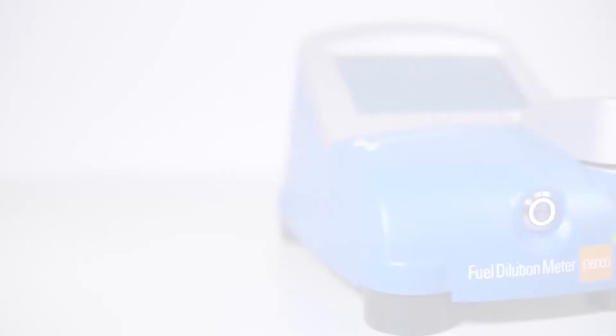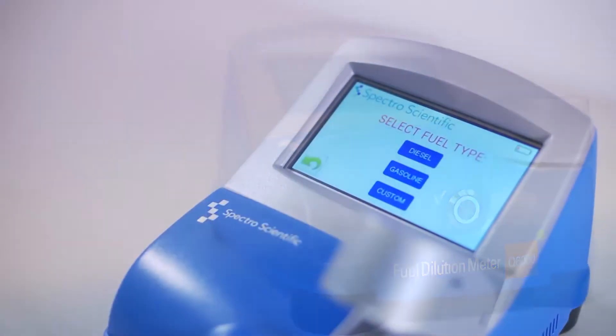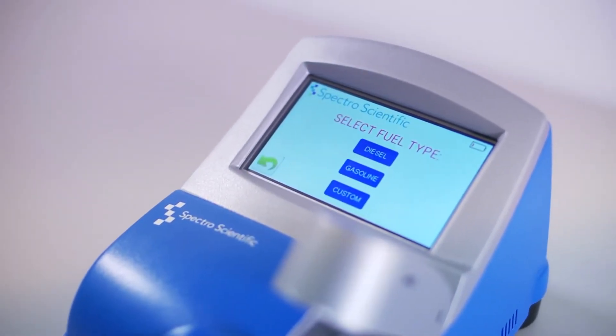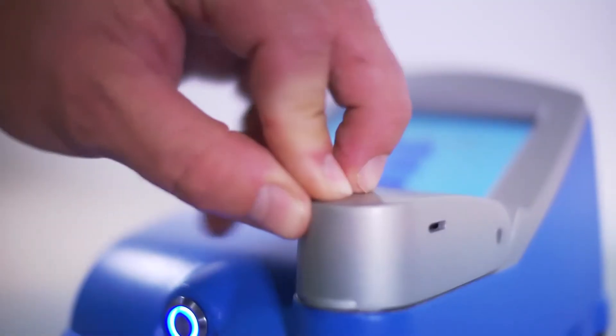Our new Q6000 takes it to the next generation. It's a compact portable product that's touchscreen with a very innovative headspace design that allows the operator to take only a small amount of fluid and be able to get consistent readings in about 40 seconds.